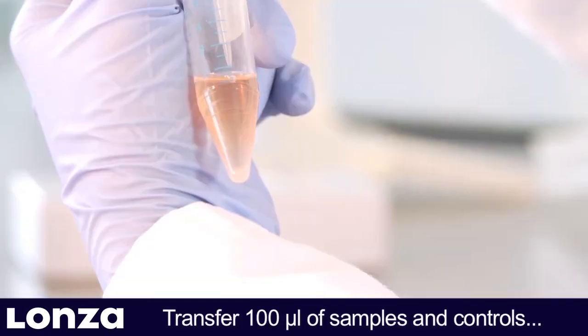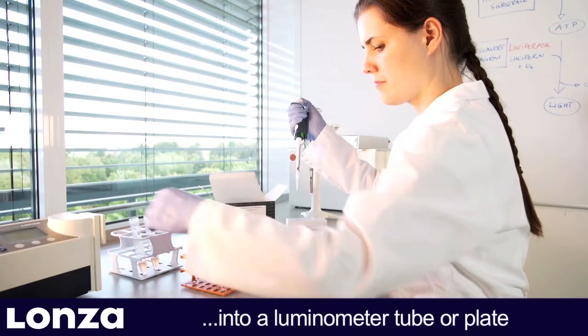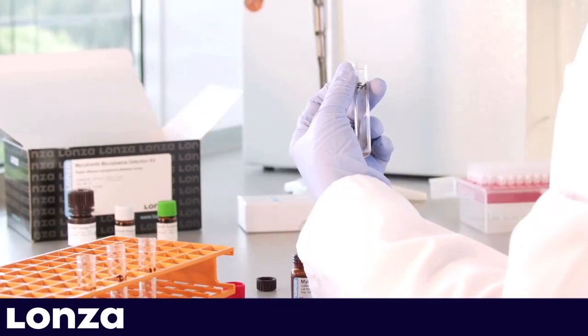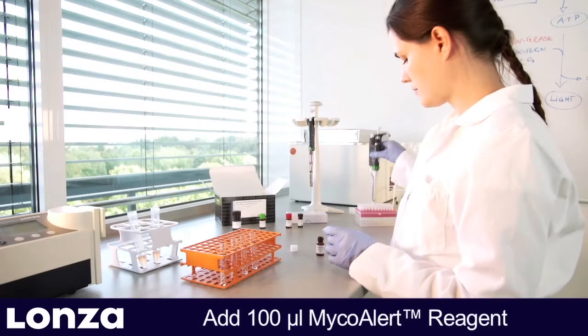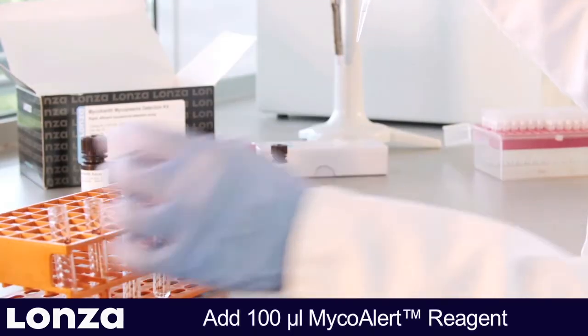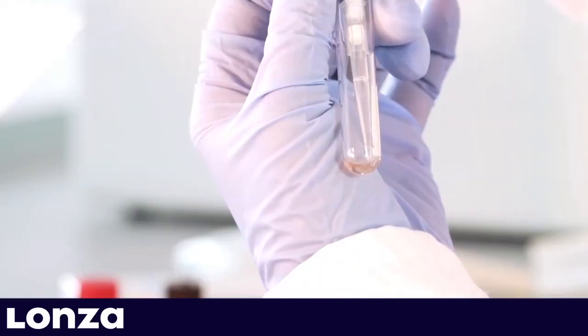Transfer 100 µL of samples and controls into a luminometer tube or plate. Add 100 µL MycoAlert reagent to each sample and incubate for 5 minutes to lyse mycoplasma and convert background ATP into light.